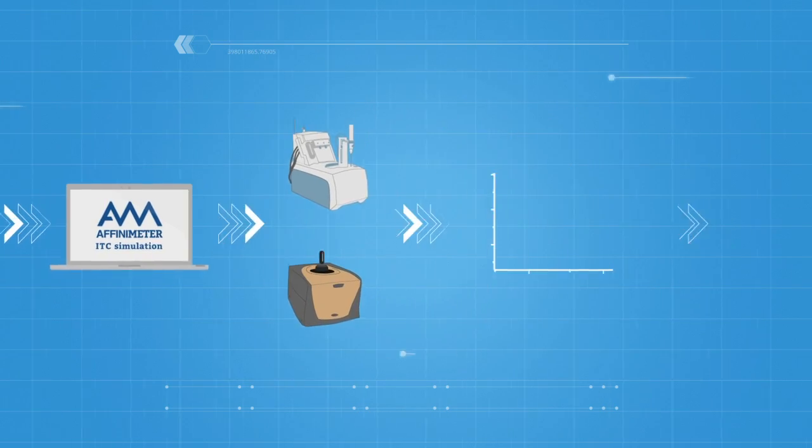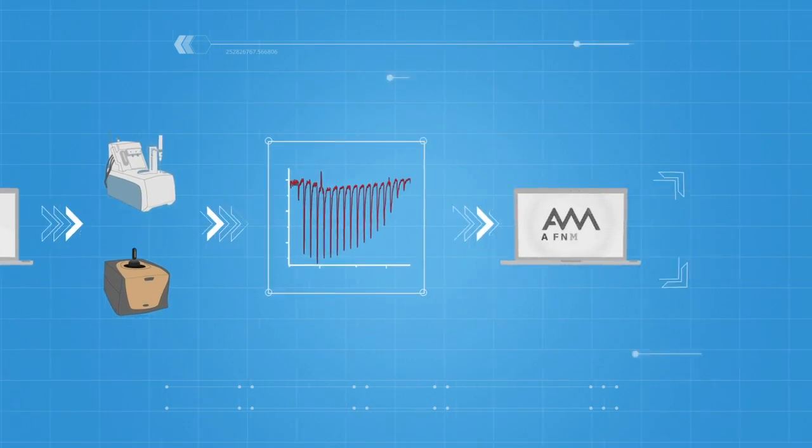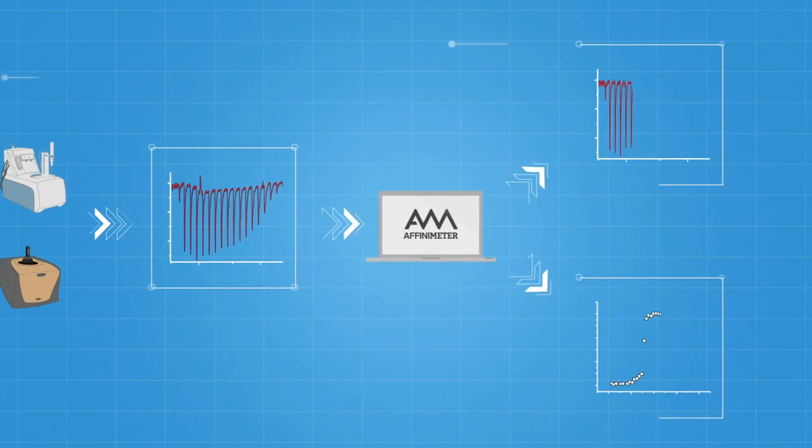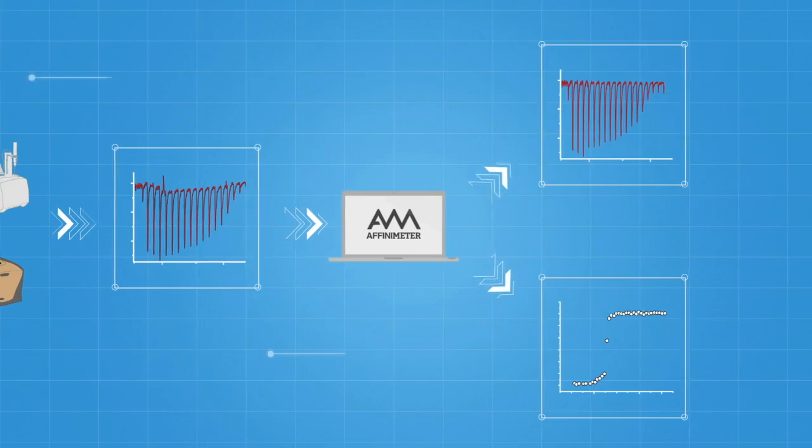Process ITC raw data to automatically correct baselines, eliminate the noise, and integrate the peaks of several thermograms.